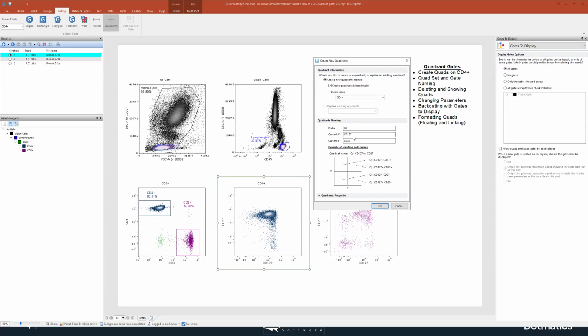So in this case, we're only showing the antibody, and that's because I'm only showing the antibody on my plots. If you remember, your X and Y axis labels are either pulled from the name or the stain keyword, and you can control whether it pulls both of those or one of those in your FCS Express user options. So whatever those user options are set to show on your X and Y axis, that's what's going to be pulled here to name your quadrants.